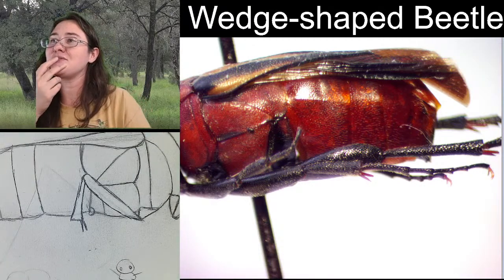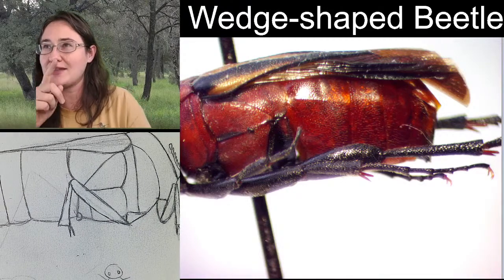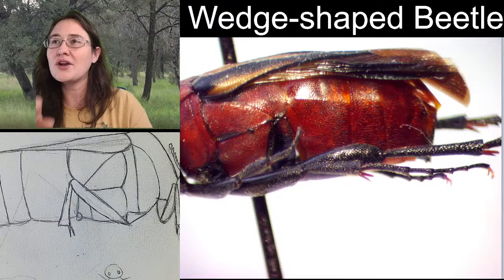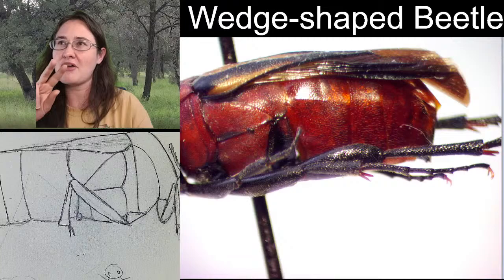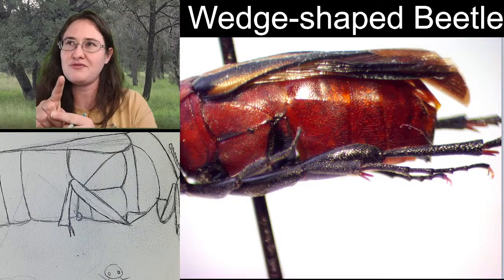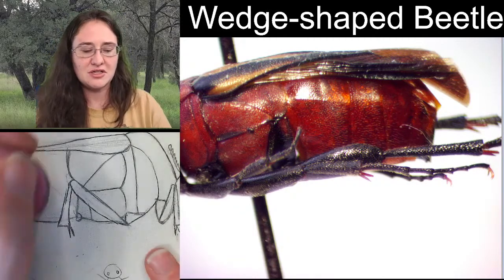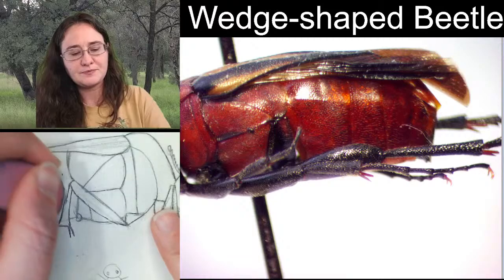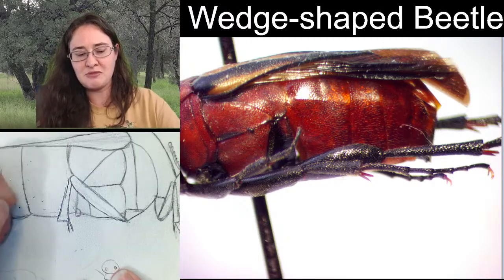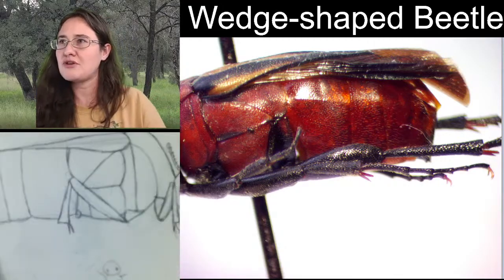Admittedly, I do know that there's a difference between tibial spines and tibial spurs, and I think that one of them is mobile and the other one is connected to the exoskeleton and can't move. Can't remember which one is which. Is it a spine or a spur? I feel like the spine doesn't move, but the spurs are mobile. They're on joints.